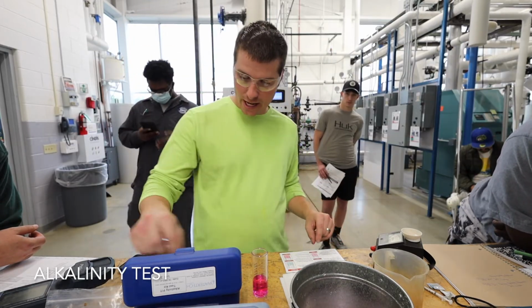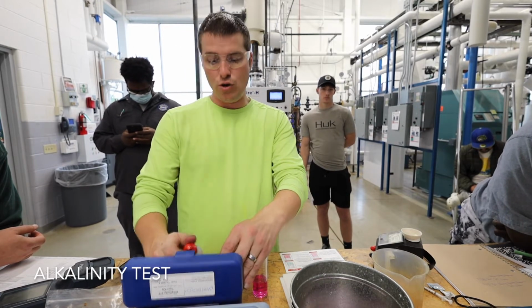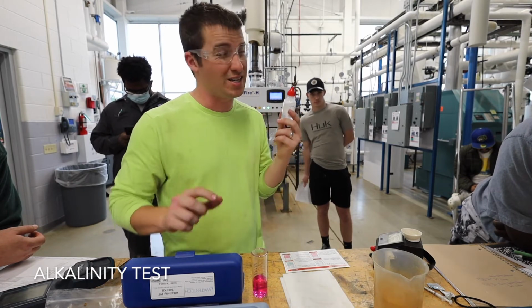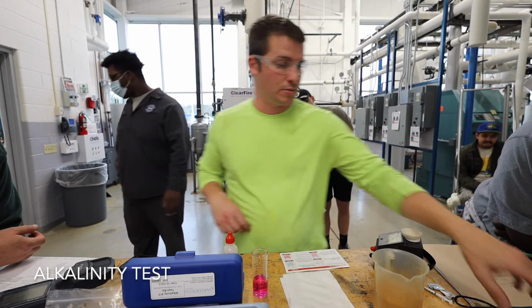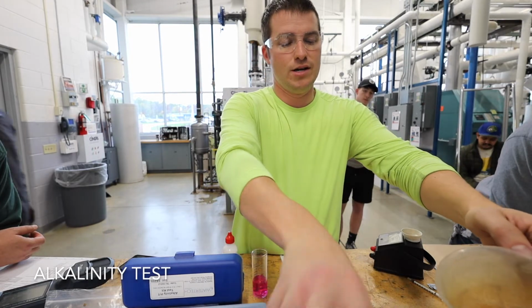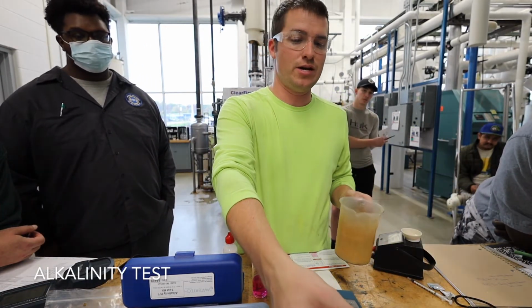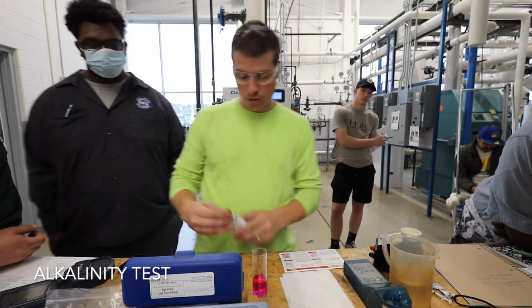Add alkalinity titrant. So let's find the alkalinity titrant. You have 1 drop equals 10 and 1 drop equals 50. We're gonna do the 1 drop equals 50 because normally in a boiler, well, before I say that, let me see what the conductivity is. When the boiler is running at the conductivity it should be running at, you're gonna have hundreds of ppm of alkalinity. So the boiler is 840. It's gonna be a little low. We're still gonna do the 1 drop equals 50.